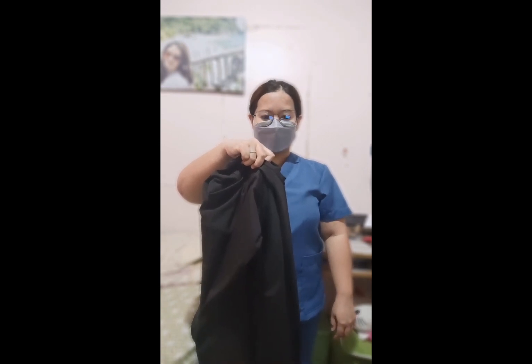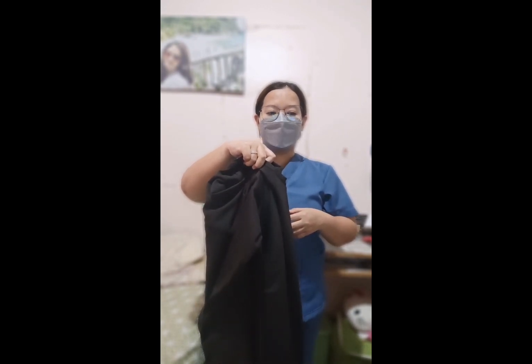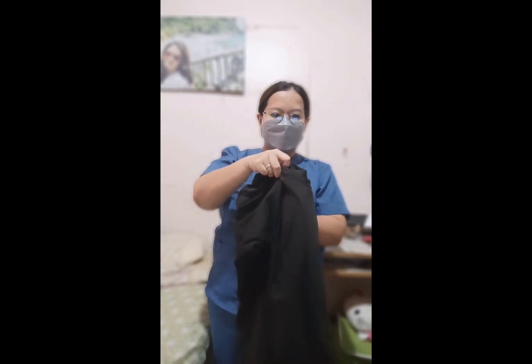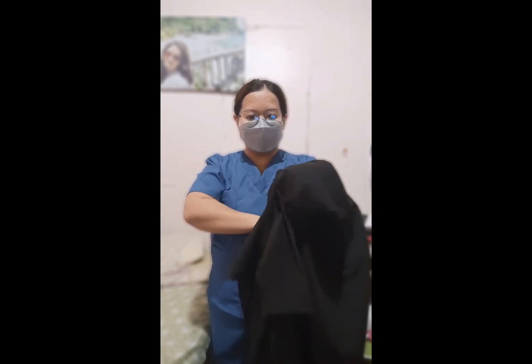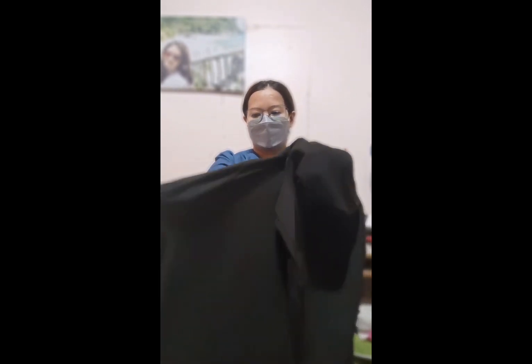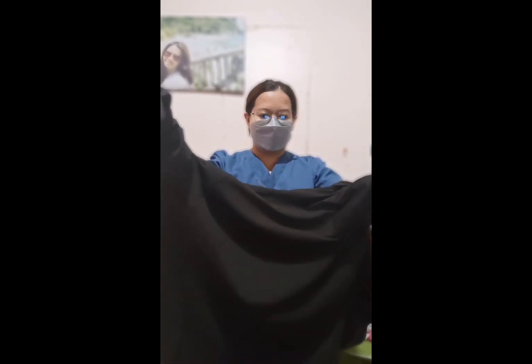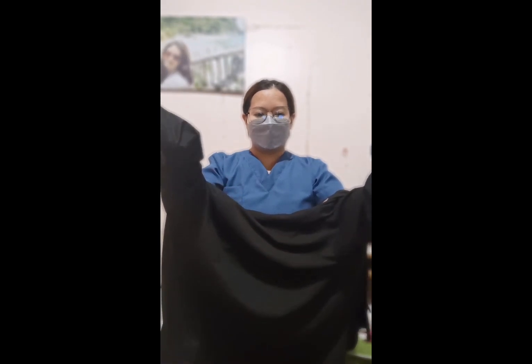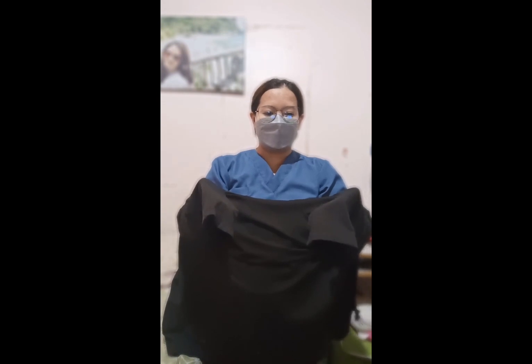The next thing that we will be doing is inserting our arms into the sleeves of the gown. Grasp the inside shoulder seams and open the gown into the armhole facing you. Next, carefully insert your arms partway into the gown, one at a time, keeping the hands and shoulders level, away from the body. Slide the arms farther into the gown sleeves until the fingertips are level with the proximal edge of the cuff. Grasp the inside seam at the cuff with the thumb and index finger. Be careful that no part of the hand protrudes from the sleeve cuff.